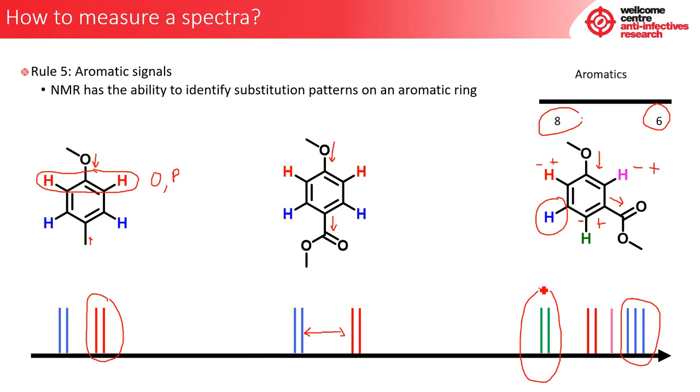The same therefore is true for when we start speaking about these two protons. The red proton is least influenced by this withdrawing group because it is furthest away, yet still the charge is carried. And the same can be said by this species here, the purple one. The methoxy and the ester group are both ortho to this group here, so you have donation and pulling away of these protons. So the group that becomes the more affected looks to be the red, because it is furthest away.